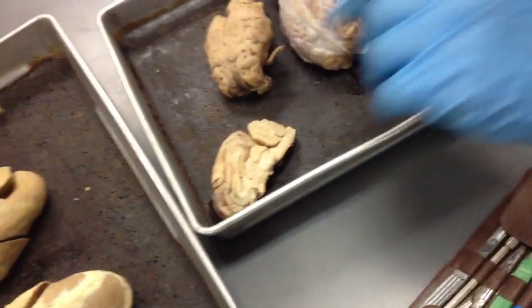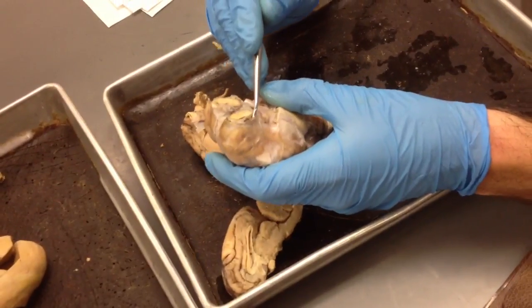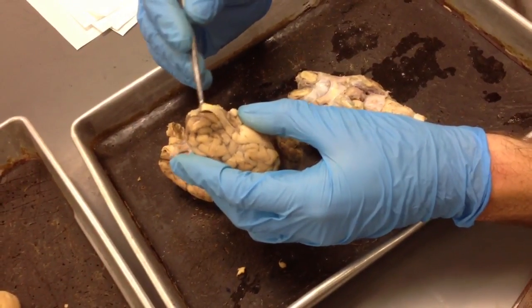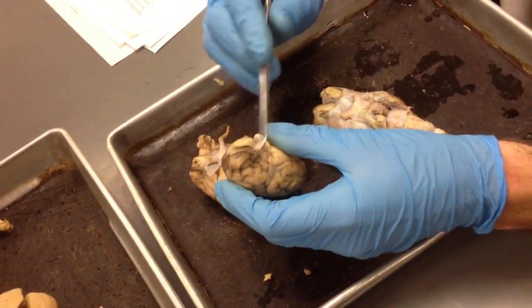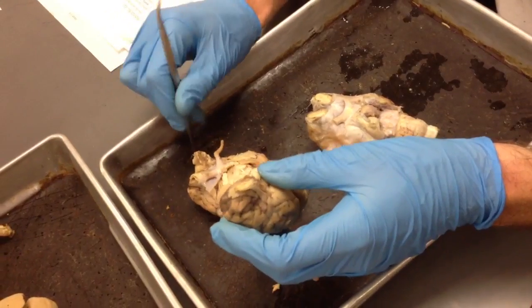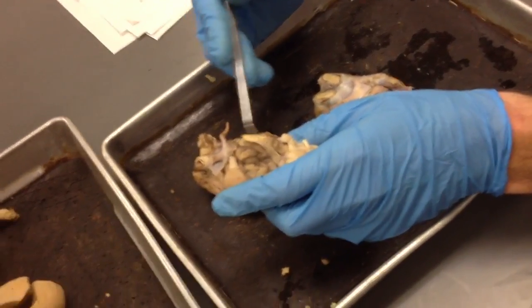Okay. First. Alright. Okay. The olfactory bulbs. So the olfactory bulbs are going to be these nice large circles here. These have the olfactory tracts removed. The olfactory tracts will look like this if still present. And the olfactory nerve is up here. You guys don't need to identify it, but it is cranial nerve number 1. It's the olfactory nerve, and it is sensory. Okay. Olfactory tracts. The olfactory tracts are right here.